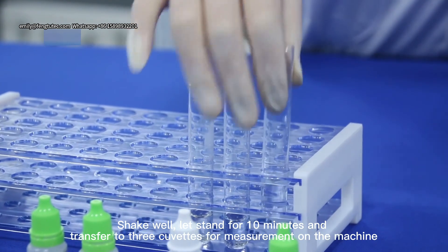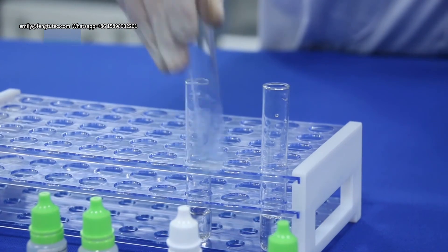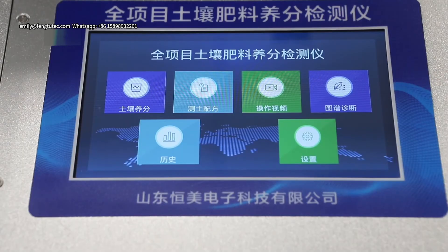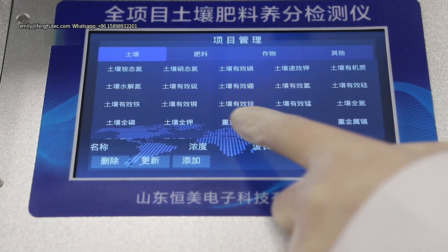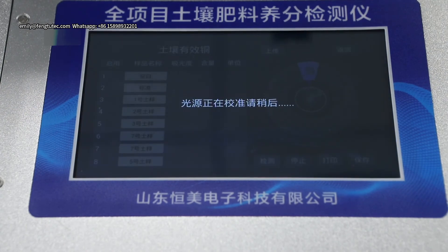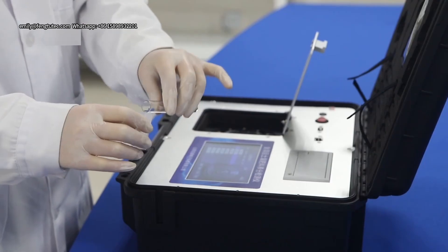Add 5 drops of Soy Available Copper number 4 reagent. Click on the screen to select Available Copper in Soil detection.